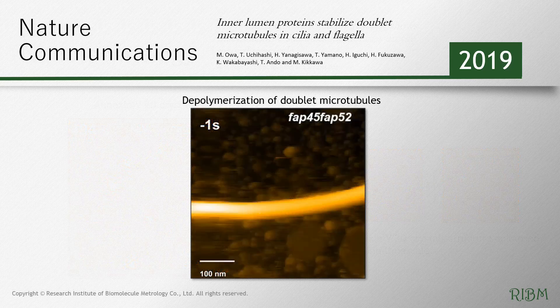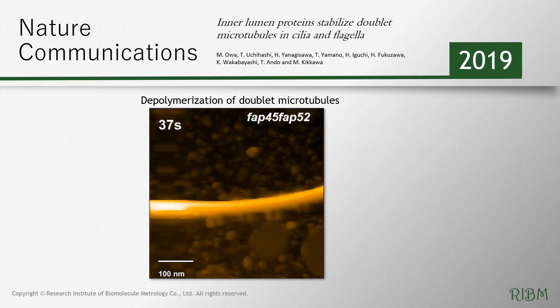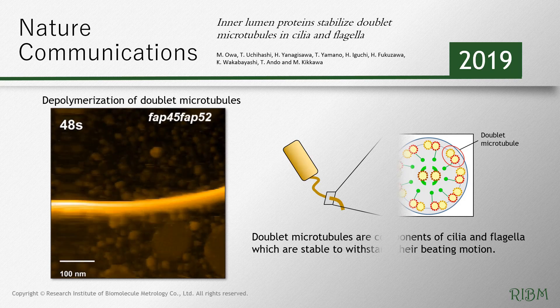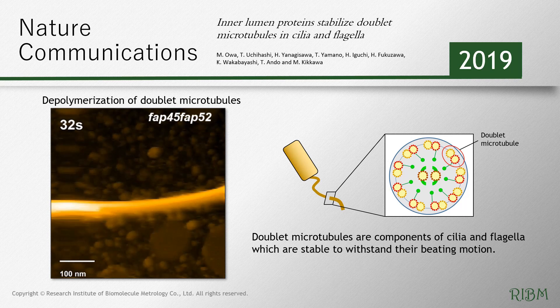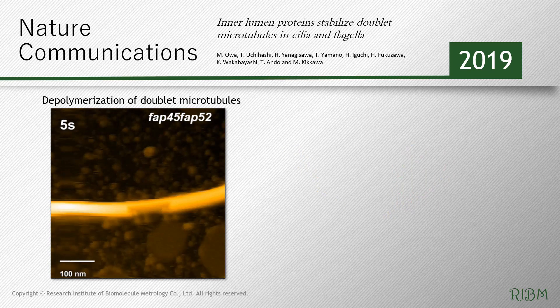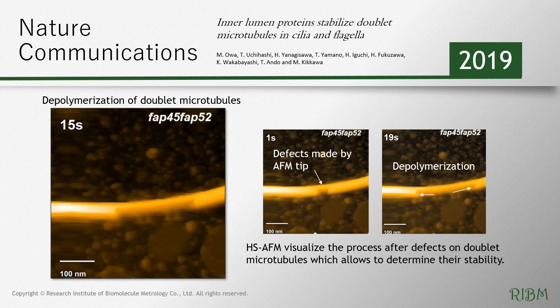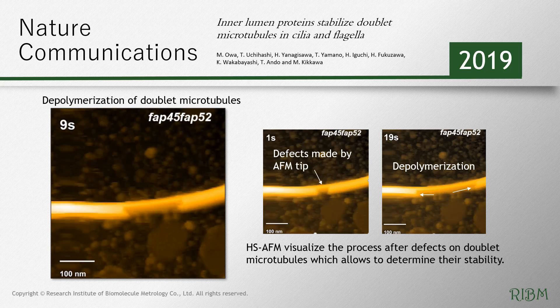The video shows the depolymerization of doublet microtubules. Doublet microtubules are components of cilia and flagella which are stable enough to withstand their beating motion. High-speed AFM visualizes the process after defects appear on doublet microtubules, allowing determination of their stability.